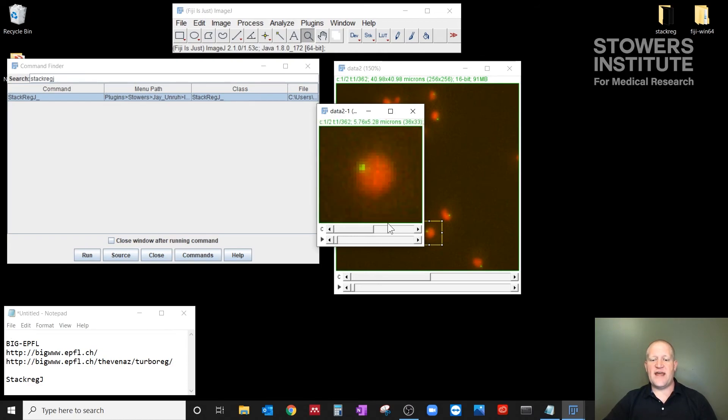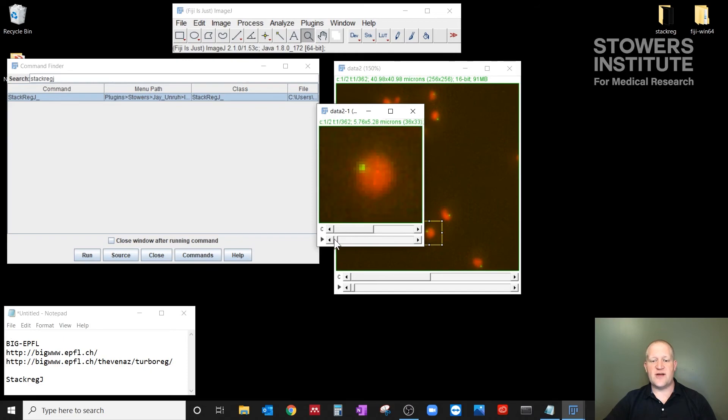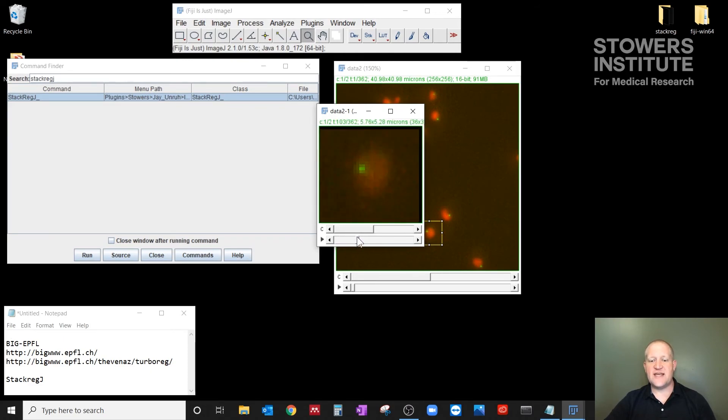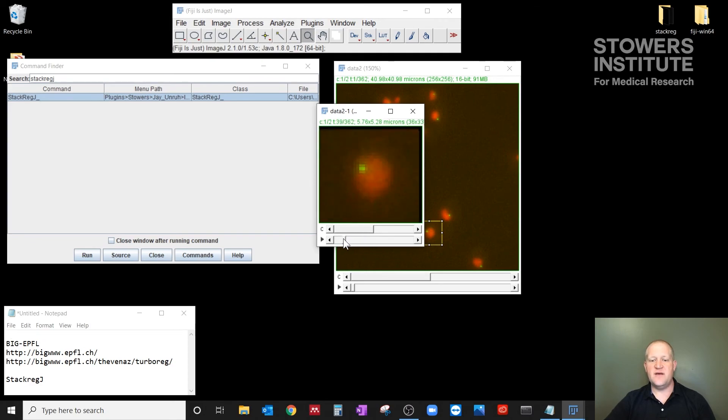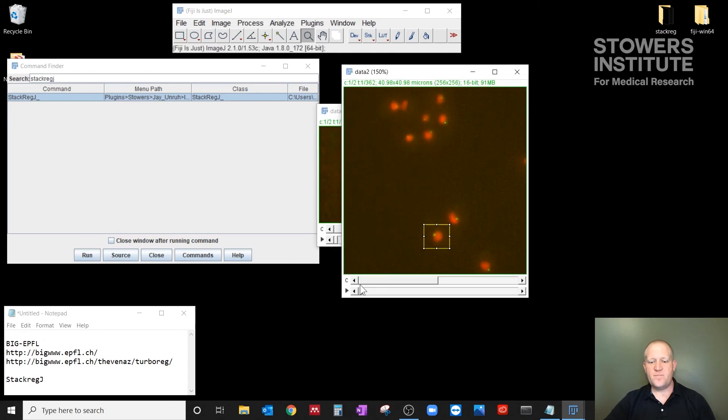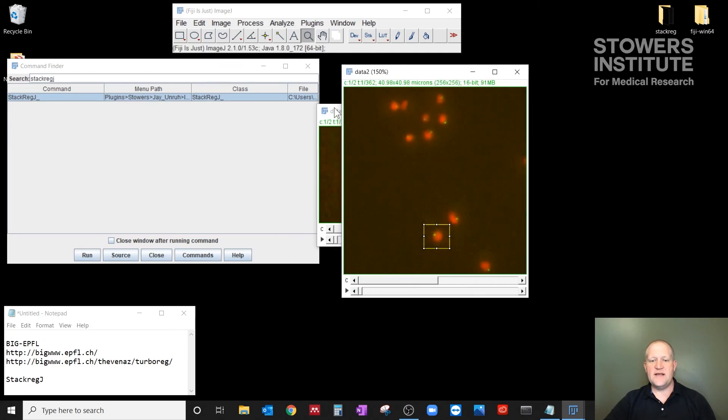If I had done the opposite, you notice that the nucleus kind of wiggles around now because it's keeping both channels together and it's changing the position of them. So the red now wanders around where in the original data, the green wandered around.